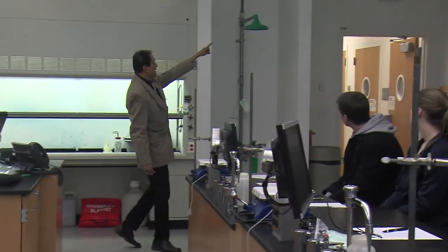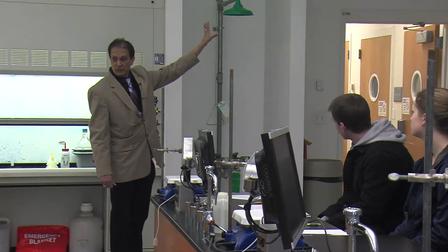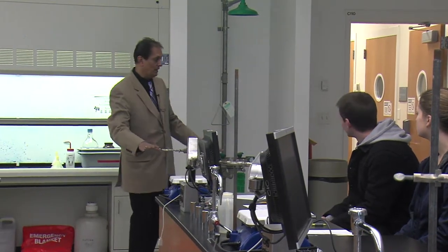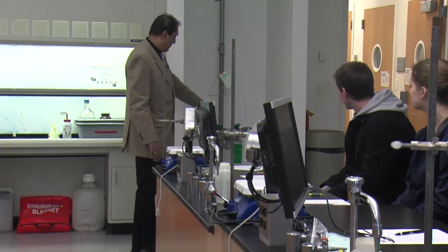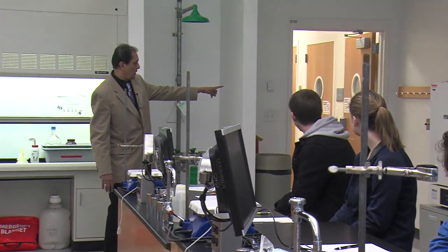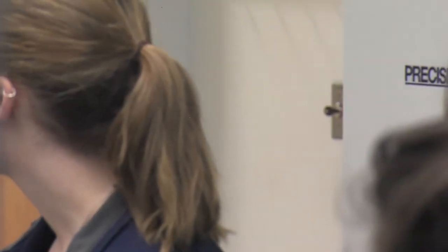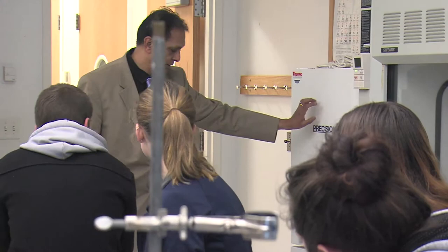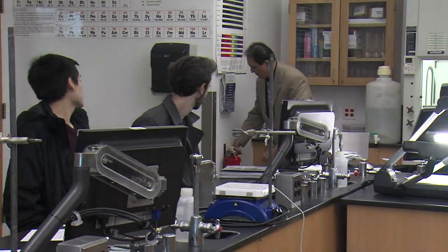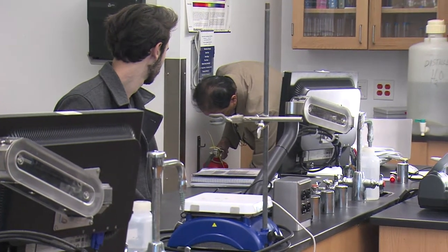We have a safety shower here. So in case of an emergency, we will use it. Do not play pranks with this because this will give out gallons and gallons of water. It will be a swimming pool over here and you will end up cleaning it for the next 3 hours. The eye wash station is over here. We have a gas cutoff on the wall over there, so if there is any fire, we can just shut it off from there, right? Oven, we will use it when needed. We have two fire extinguishers present, all right? These are called the A, B, and C fire extinguishers.